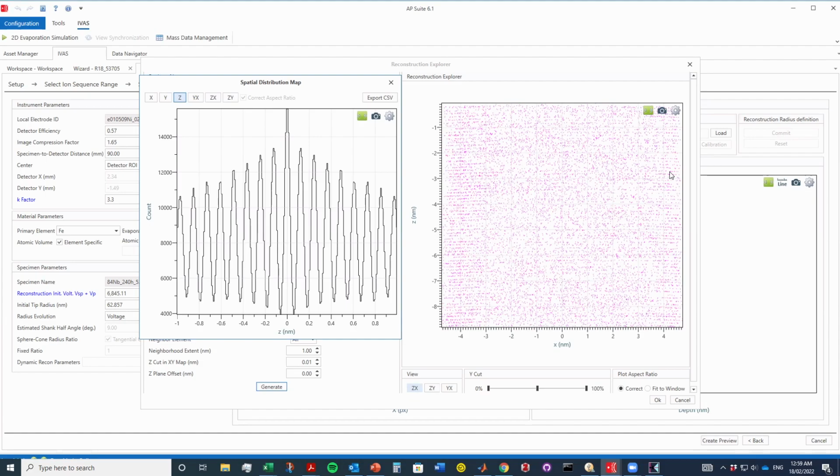So essentially, when we calibrate reconstructions, what we always want is something that we know about the sample. And one thing that's actually fairly reliable is the sample's crystal structure. There is no really realistic scenario where, if you have an aluminium sample, the lattice parameter would just deviate magically from that of pure aluminium.